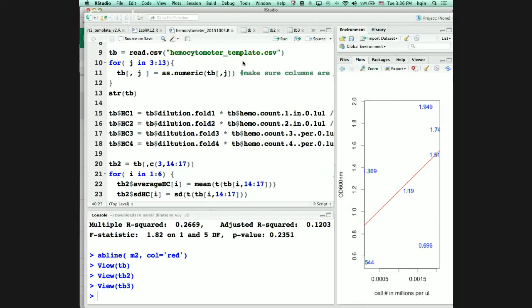Okay, so yeah, this is probably your first test case with actually using a code to analyze something for most of it. So, did you write the code? Yeah, I wrote the code. And I wrote it on the slide. Right. That is true. But this is really not.